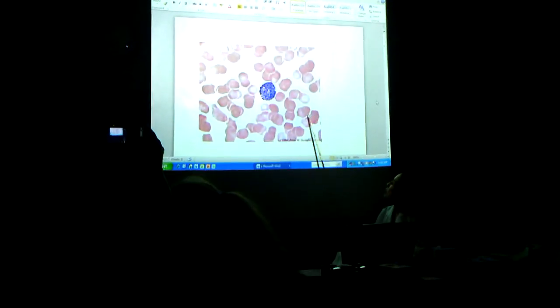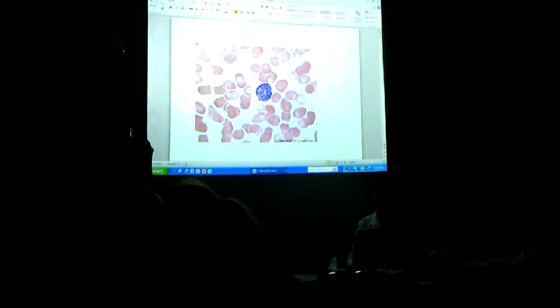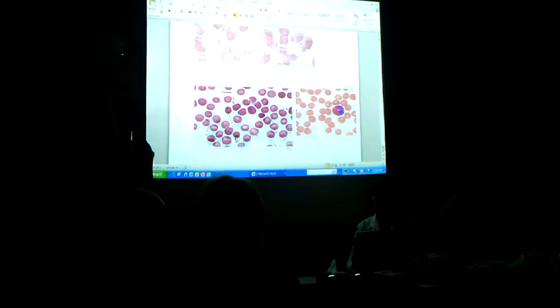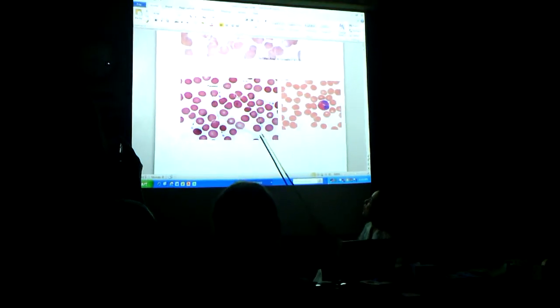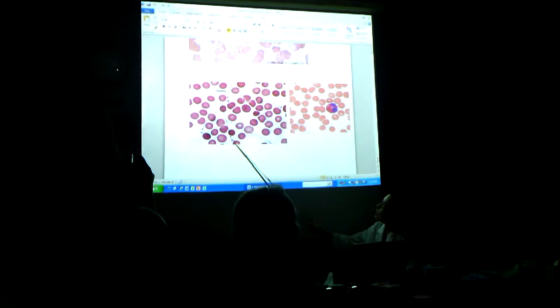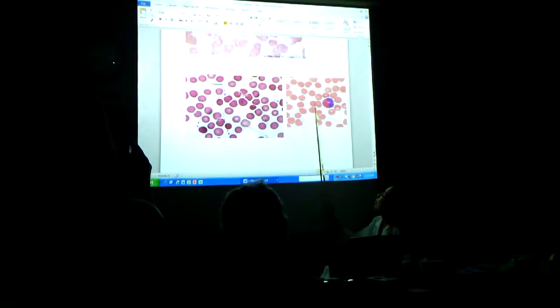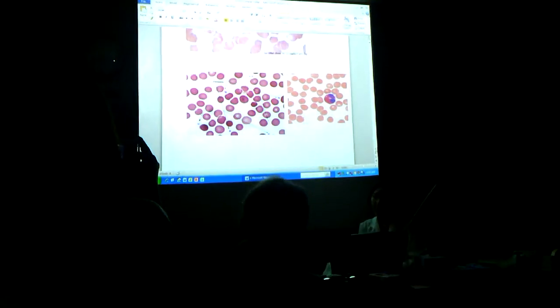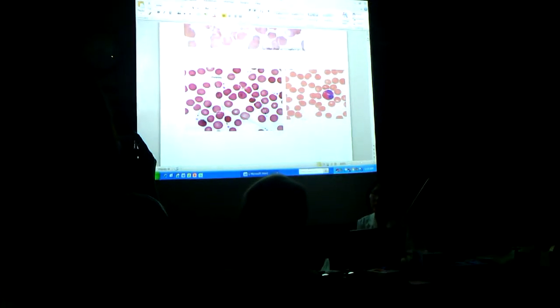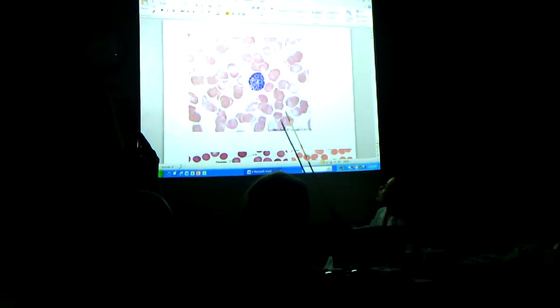And these are the red blood cells. Let me scroll down. These are your red blood cells. We're going to start talking about blood today. And then these are the platelets for blood clotting. And so you see they're all here. But when we look at a blood smear slide, we're really looking at the white blood cells rather than the red blood cells. So this is the basophil.